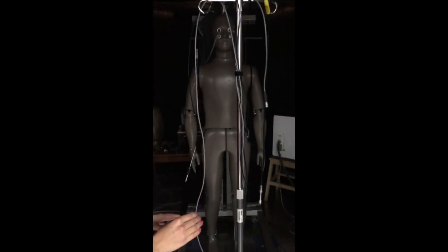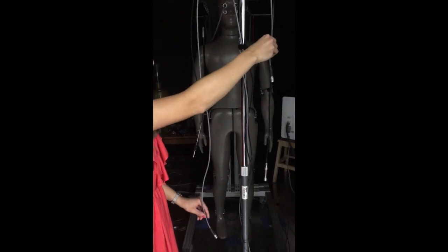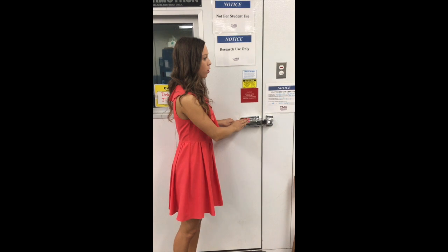Next, you'll place the IV cart right over the tape on the floor in the center of the mannequin, before the mannequin. Make sure all 4 cords are on here. The 2 temperature ones are located at different heights. The humidity sensor is on here, and also the air velocity sensor. For this, twist open the black carefully and slide it up, then tighten to close it. When you're finished, close the door and turn the light switch off.